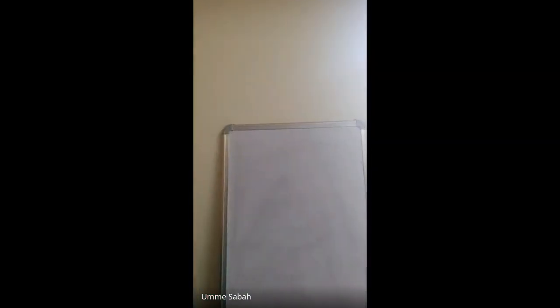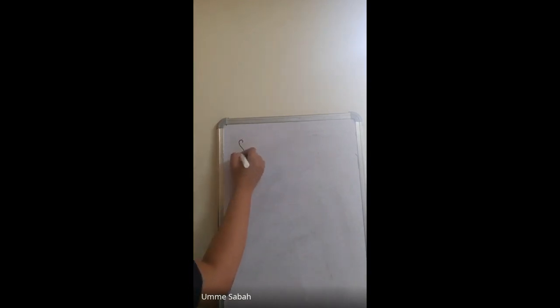So with the help of a loop, we take the organism from one plate and we streak it out. Since you are all non-micro students, streaking means, this is a plate and I will streak in whatever manner I want. I want a zigzag manner, that is one organism in the center of my plate. Or in one plate, I want four different organisms, I'll take one plate and draw an edge. Now coming to this term streaking, you will hear it until you finish your practicals, or if you are a micro student, until your post graduation. This term is always there in our life.